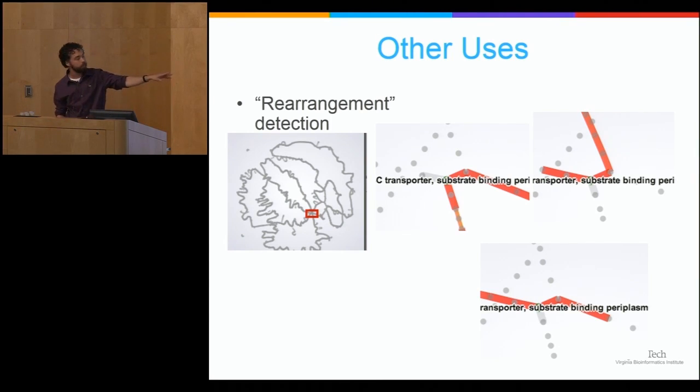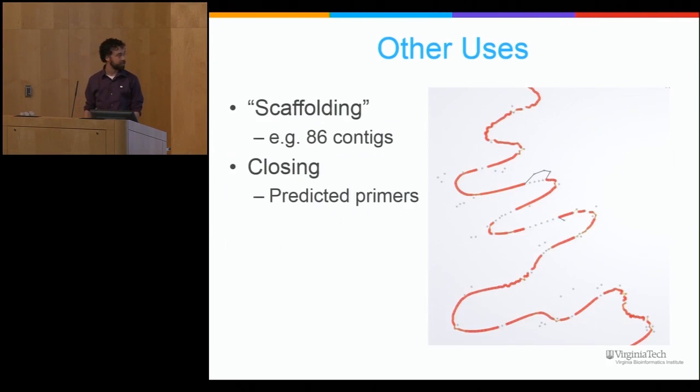But then there's one genome which connects chromosome 1 and chromosome 2 in this region of homology between the two molecules. What that indicates is that there's probably an assembly mistake. When you're creating the assembly, you're extending out based on similarity in sequence, and they extended out in the wrong direction, and they created a molecule that didn't exist. So that is one thing that this is able to detect.